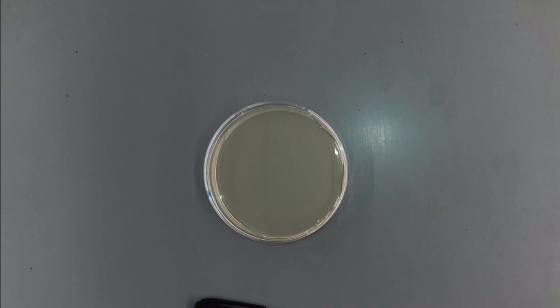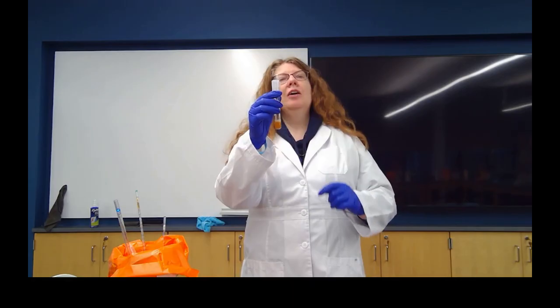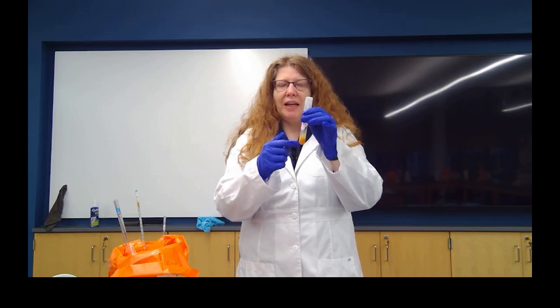Another method we will use is called the spread plate. And so for the spread plate, what you need is a plate of nutrient agar and our tube of broth. Remember, every time you use a tube of broth, you either need to vortex it or you need to mix it by hand. So we're going to mix it by hand to make sure it's well agitated.